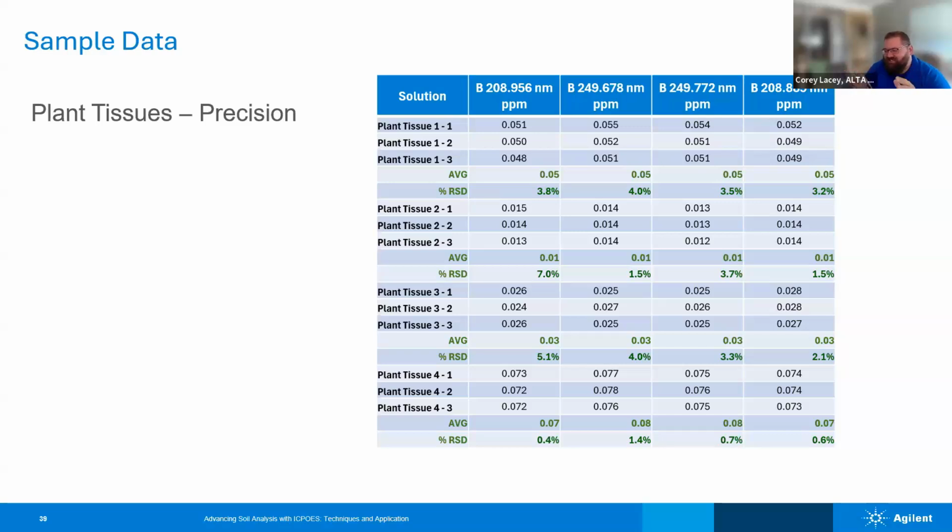I see a whole presentation on that topic. I do love how it highlights that some of the biggest challenges when it comes to ICP-OES are sample introduction systems, and I appreciate you pointing that out for our members.